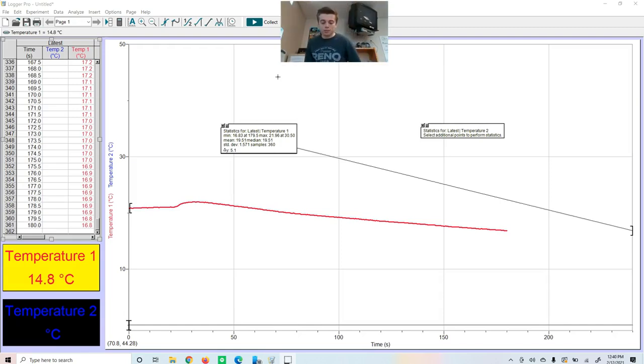All you have to do now is go back and calculate that delta T, and then answer the questions on the next page. Basically, I'm asking you, between every trial we did, which one had the stronger intermolecular force.